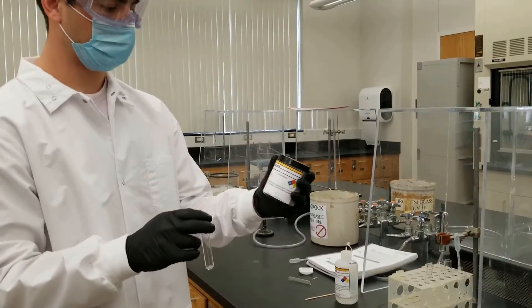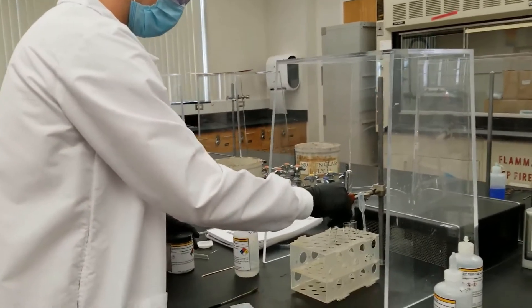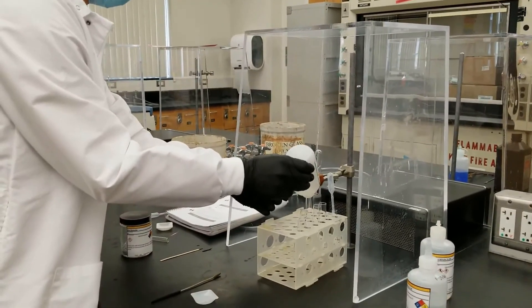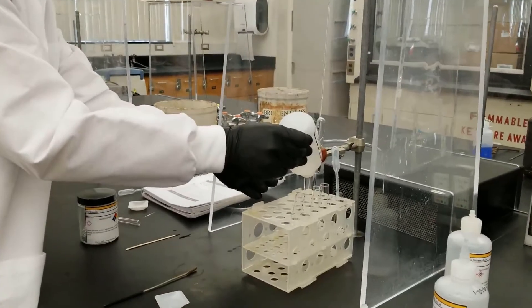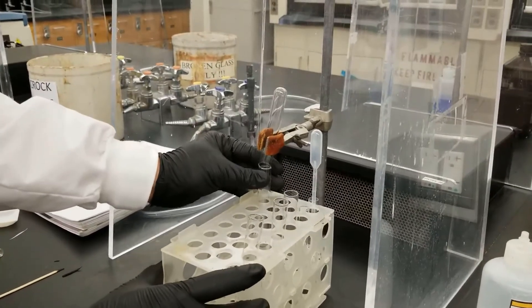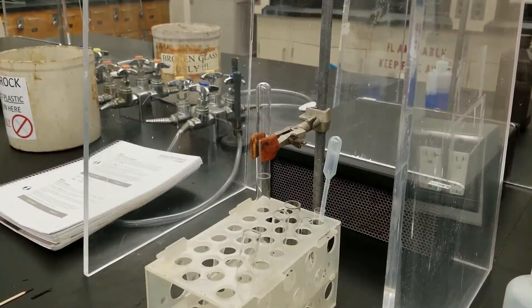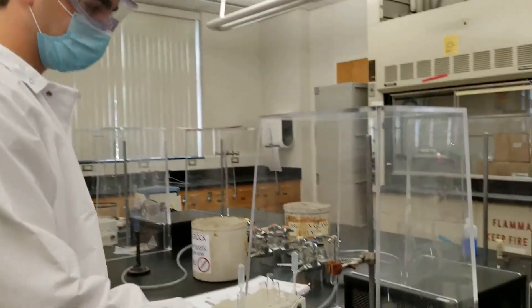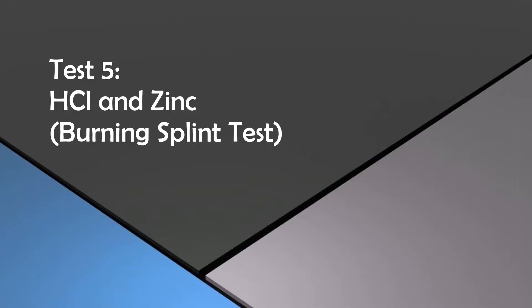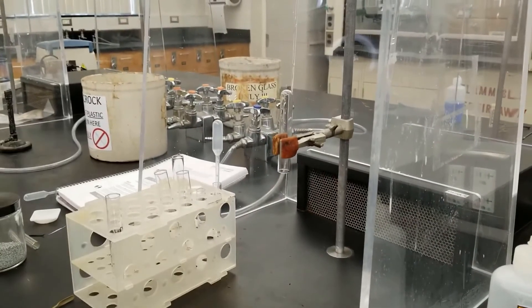For this portion of the experiment, we are going to add zinc to a test tube. We are going to place this test tube in a rack, add six molar hydrochloric acid, a couple of drops, and then hurry and put it under another test tube so we can catch any gases that escape. There it is reacting. We are going to do a glowing splint test now, and then a burning splint test. Whoa!